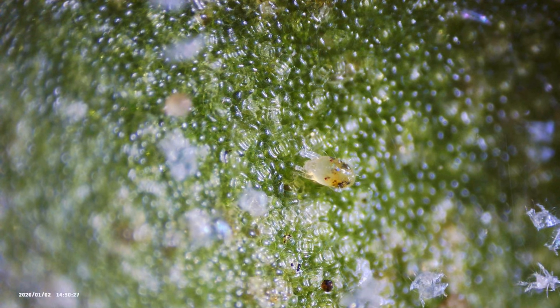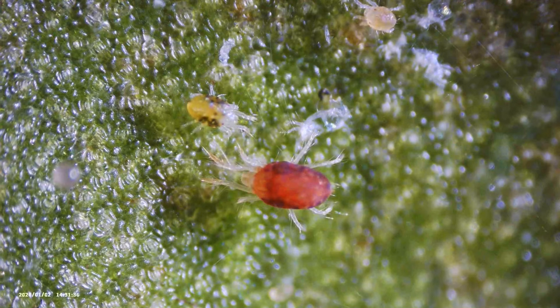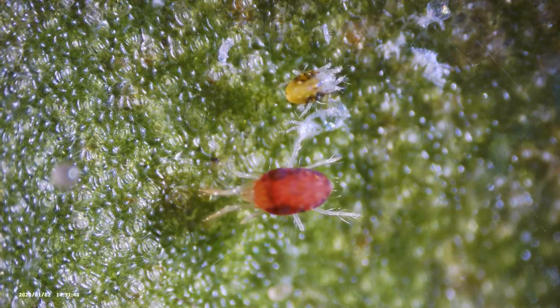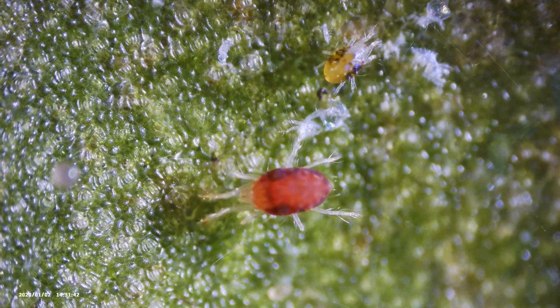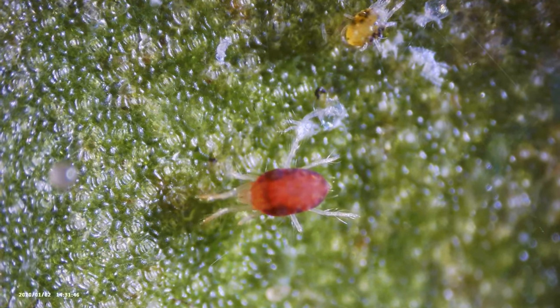Another way of finding these guys is the damage they leave behind. They leave really tiny specks — basically empty cells on the plant. Each cell they stick their little sucker into, they suck out the juices, and that cell will die, leaving a little light yellow-brown speck. So if you start to see specks appearing on your leaves, you probably have spider mites crawling around.